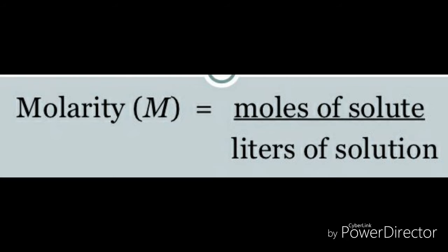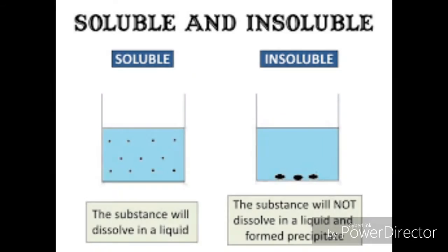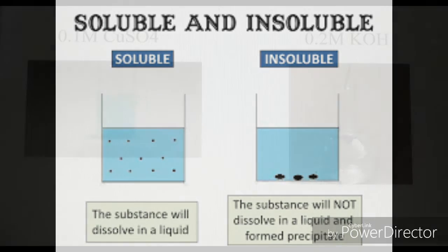Concentration, shown in molarity, is valuable in also identifying the limiting and excess reactants. Molarity shows the amount of particles present in a certain amount of space. Also in this lab, the reactants were soluble substances before mixing, but after mixing in the solution form insoluble substances, which cannot dissolve in water at room temperature. These insoluble substances that emerge in the mixture are called the precipitate.